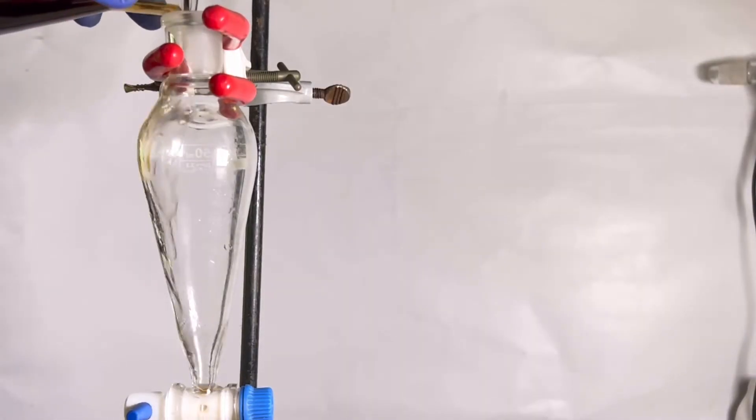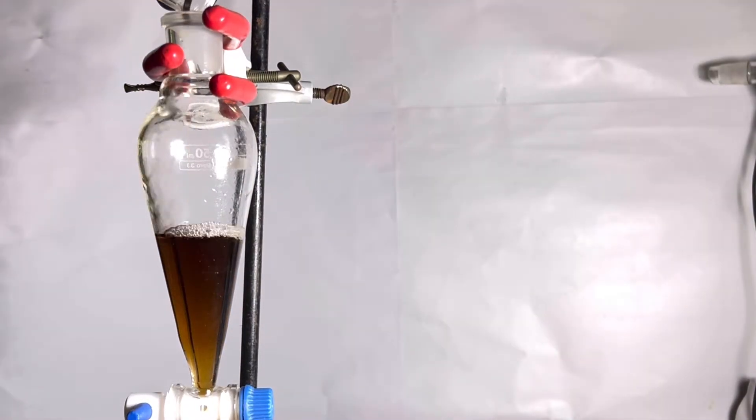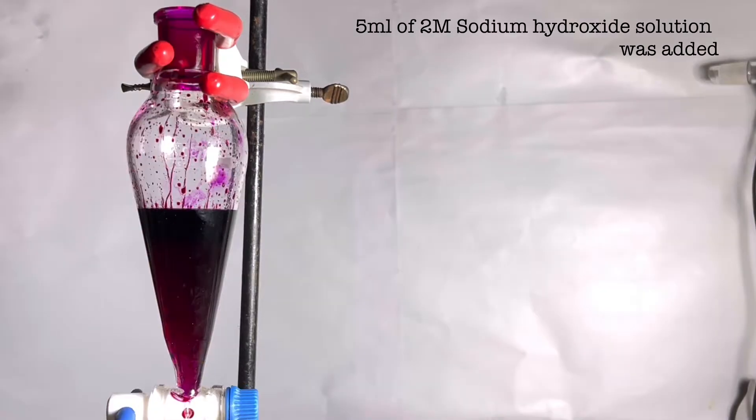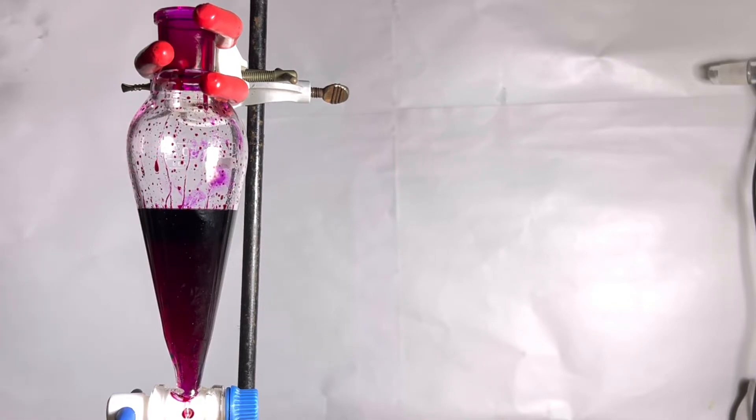Now the combined organic layer is transferred to a separatory funnel. 5 ml of 2 molar solution of sodium hydroxide was added to the dichloromethane in the separatory funnel. Immediately the sodium hydroxide layer turns deep purple in color. This is because in sodium hydroxide, phenolphthalein exists as its water-soluble salt form which has this characteristic purple color. Also it has more affinity in the aqueous phase than in the dichloromethane. So it comes into the top aqueous layer.